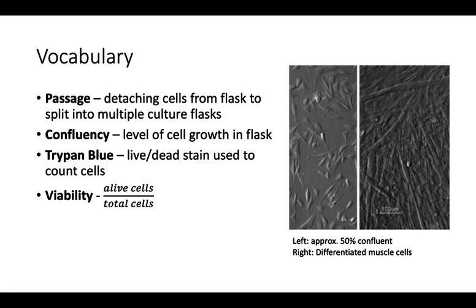It's more of a qualitative measurement that we make based just on experience. And so on the right-hand side, you can see these cells have filled and proliferated to cover the entirety of the cell flask. And they're even starting to differentiate. You can see them forming longer tubules.